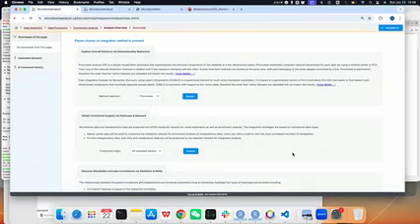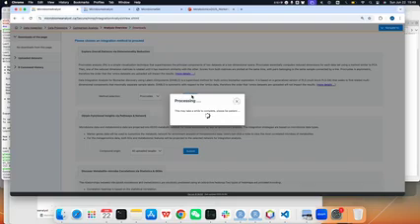After this, we can go to the method summary. We have three big categories. The first is dimension reduction. We only select two methods, Procrustes and DIABLO. The first one is unsupervised, and DIABLO is supervised. Procrustes is a post-hoc integration: it first analyzes the separate omics, and then combines the results to explain. But DIABLO models the different omics together to find the latent components. So the concepts are different, and we may see some interesting results here.